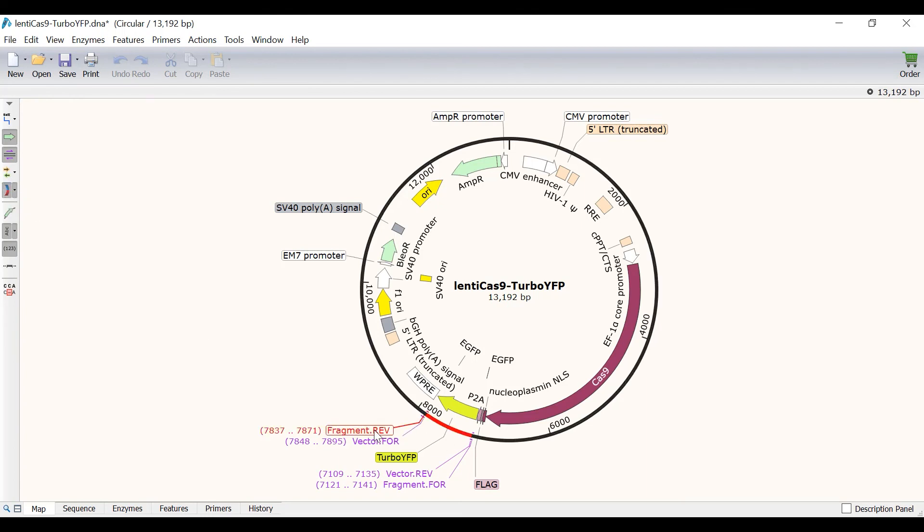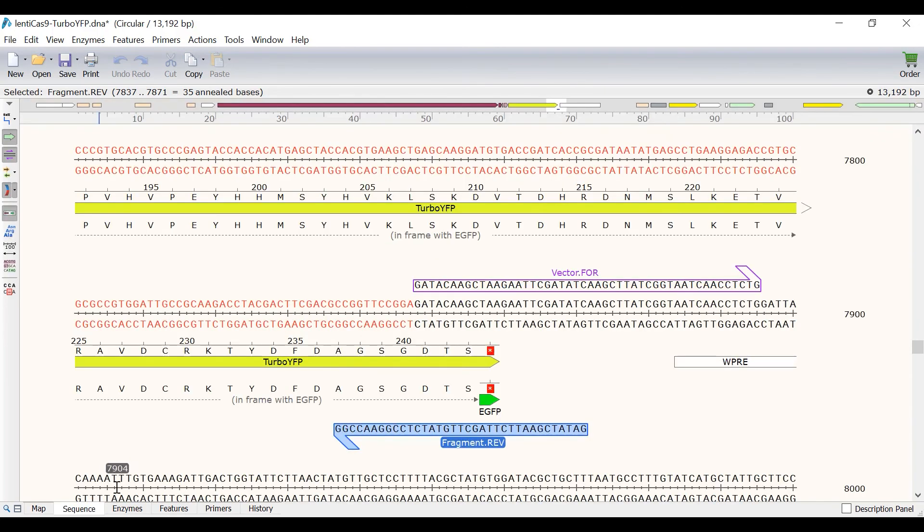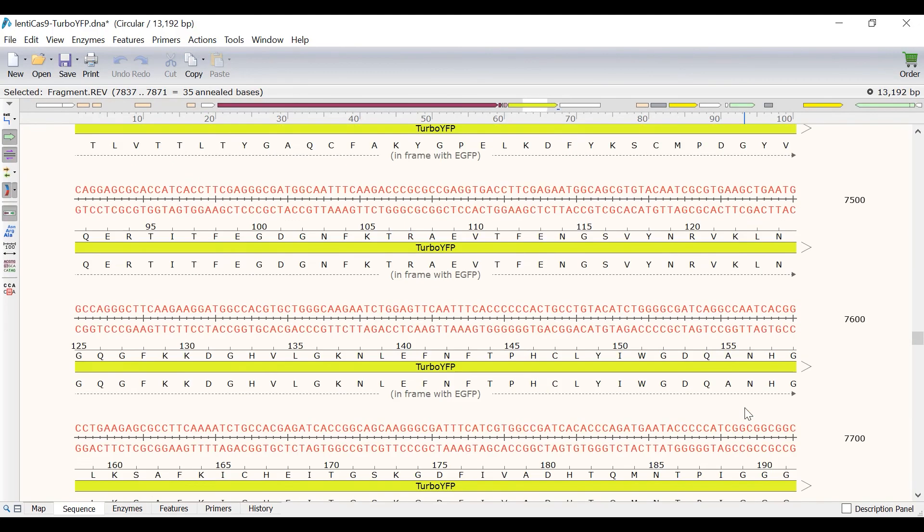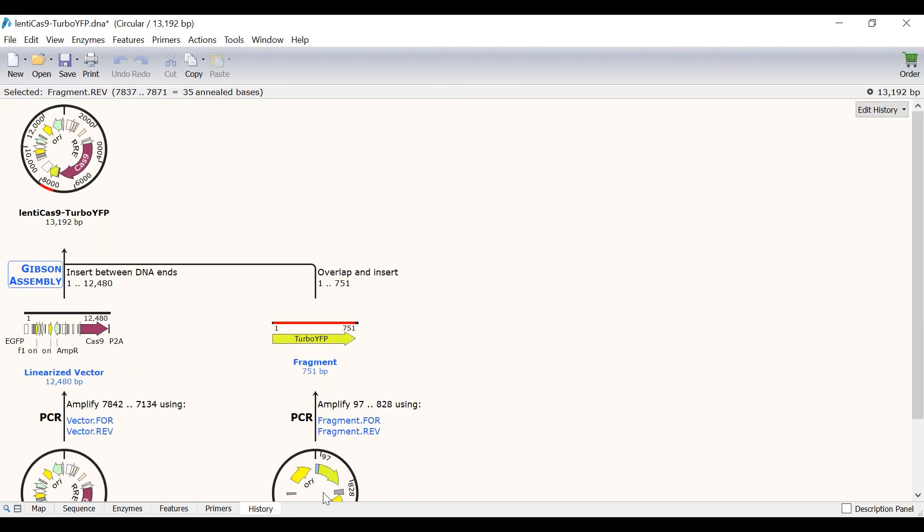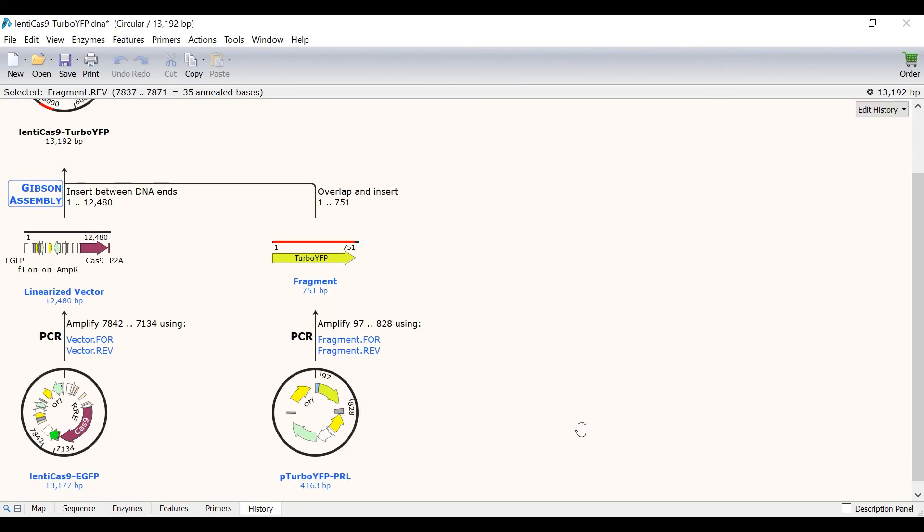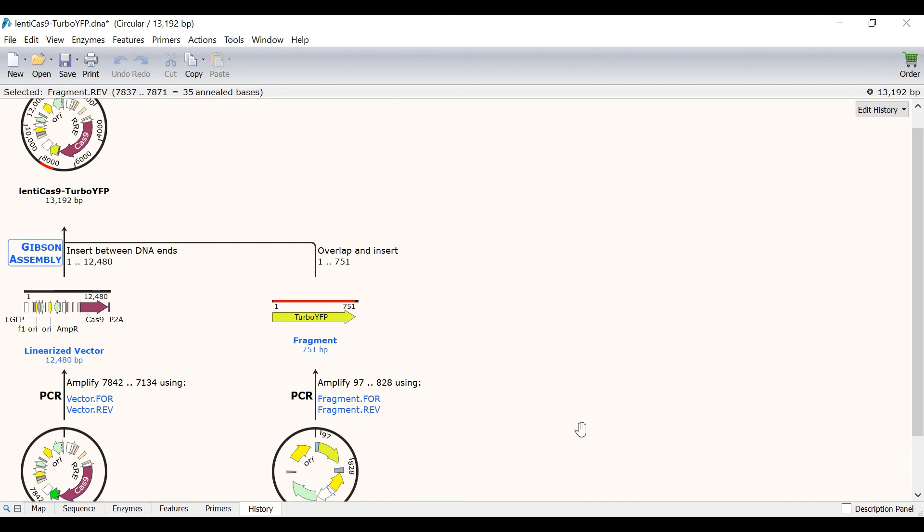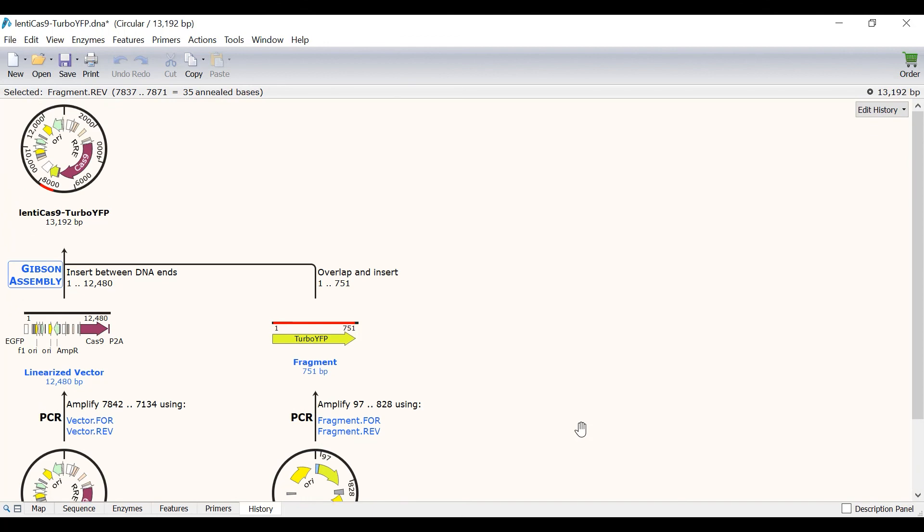If I switch to the sequence view and scroll down to the new fragment, I can see the vector and fragment primers and their overlaps. Finally, going to the history view will show a schematic workflow of the Gibson assembly that has just been performed.